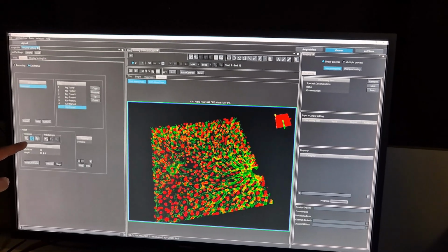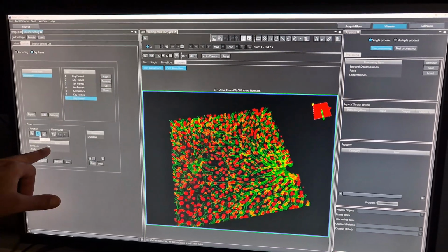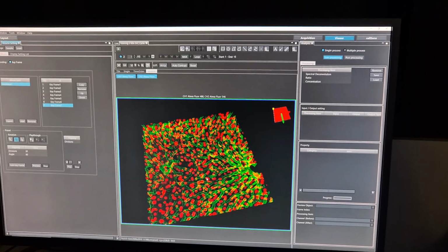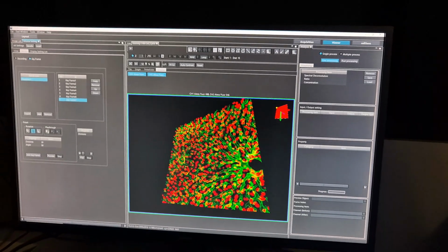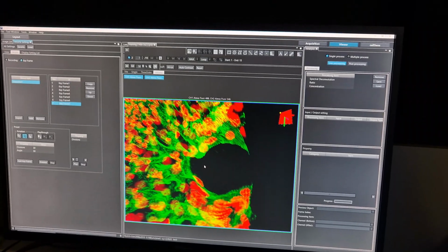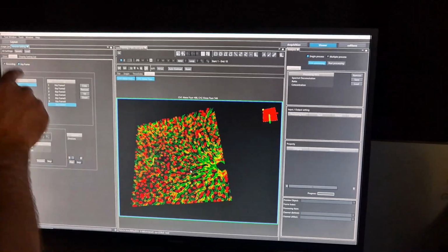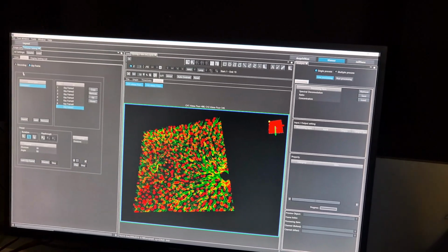So here we've got this angular rotation, X and Y, so it'll spin like this. How many divisions, what angle, you can specify that, and these are the more rigid way to do it. Most people just use this, but you can also just get this and spin it, keyframe, and then I might want to focus here, go like this, and move here. You can just create whatever you want. It's kind of like when you press keyframe, it's being logged, and then it will extrapolate the movement in between.